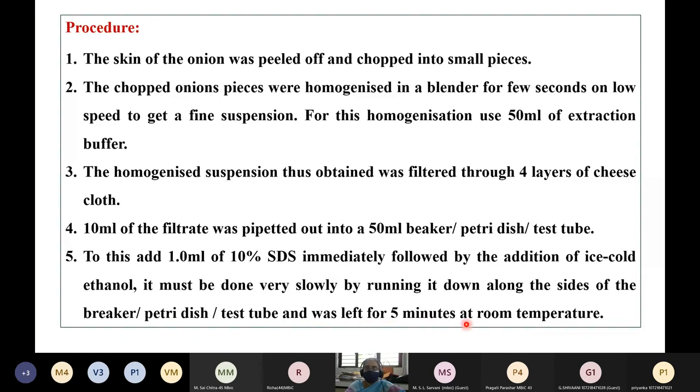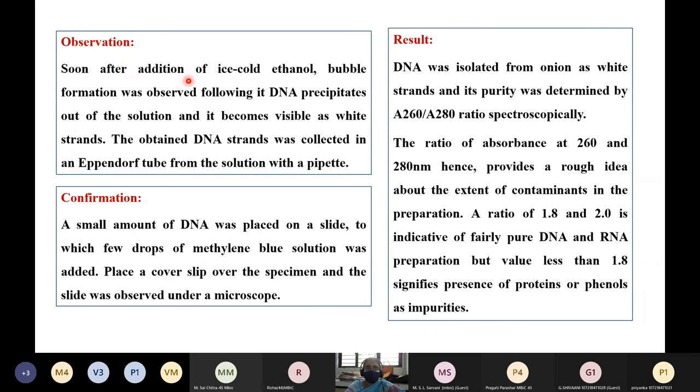The mixture was left aside for 5 minutes at room temperature. Soon after addition of ice cold ethanol, bubbles will be formed, followed by DNA precipitation out of the solution, which becomes visible as white color strands. The DNA strands were collected in an Eppendorf tube from the solution with a pipette. For confirmation, a small amount of DNA was placed on a slide, a few drops of methylene blue solution were added, a cover slip was placed, and the slide was observed under a microscope.